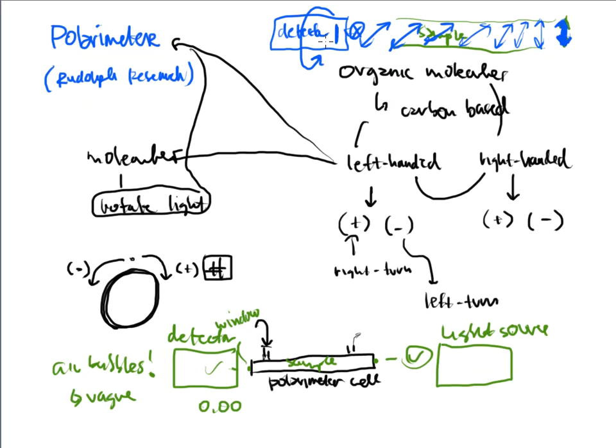Well, depending on how much it turns, that is my readout. So let's say it's 3.21. It's 3.21 degrees. That's what we understand that number to be. And there will be a positive or a negative up here to let you know which way it did turn on itself. Did it turn left-handed? Did it turn right-handed? Well, you're probably wondering, why does that make any sense?